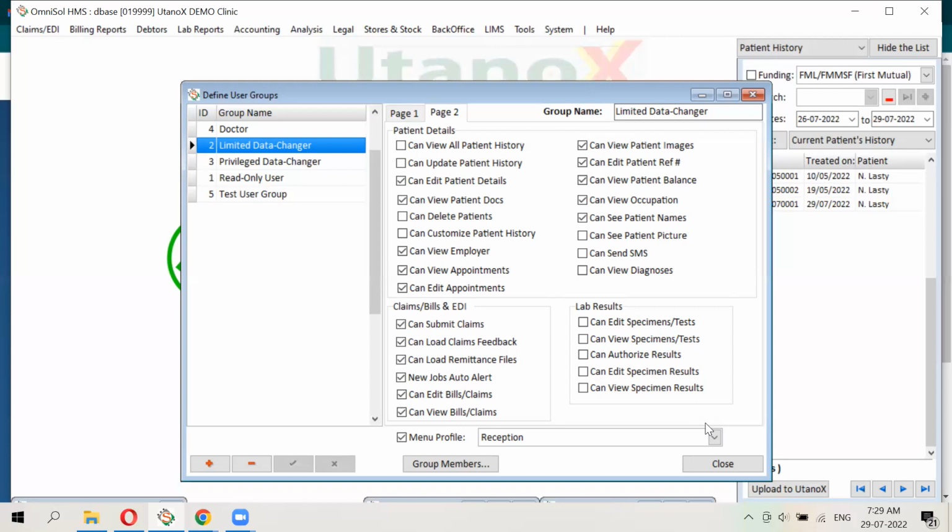That's the kind of scenario we build the system around. So yes, I think that scenario would be well catered for. Okay. And then, we're just doing more of a summary, right? We are not getting too much into detail.